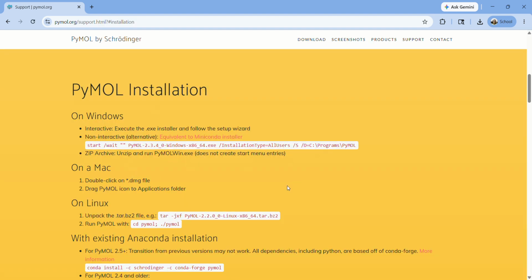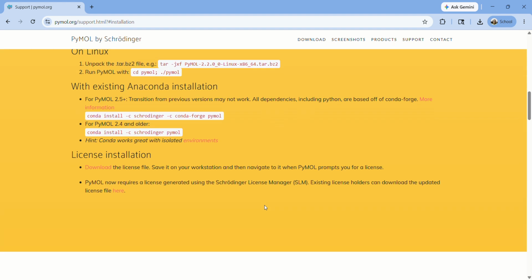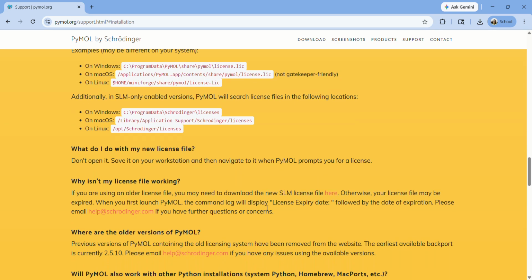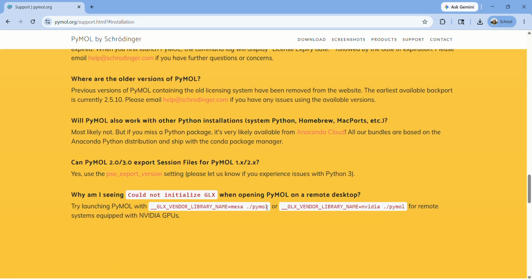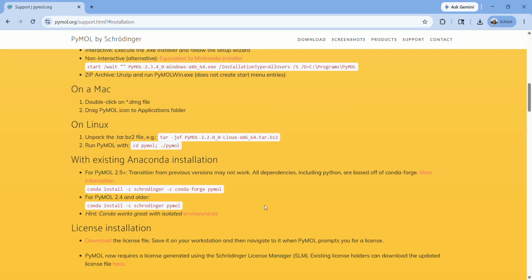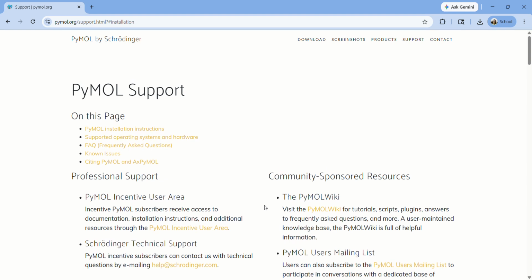You can see there is a list of important points. You can simply pause the video and see what it is. As a suggestion only, your C drive should have enough space to download this software, because this software is heavy. After the download of the software, we need to operate the content with the software as well. For that, the C drive should be free.